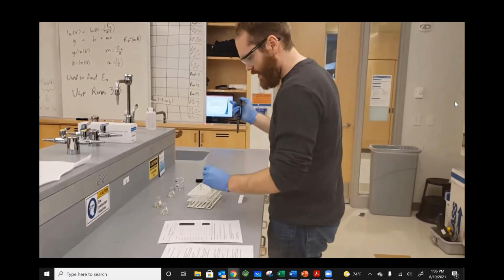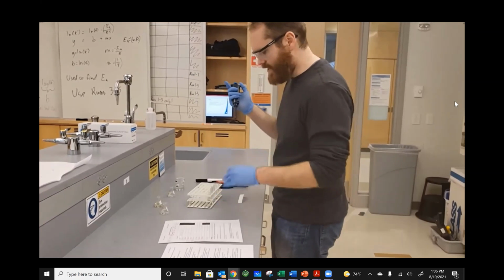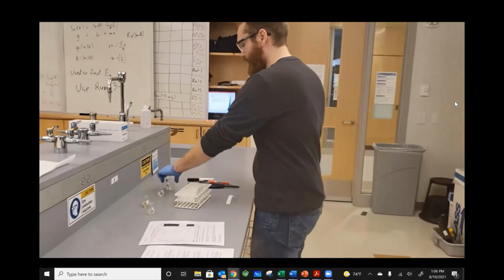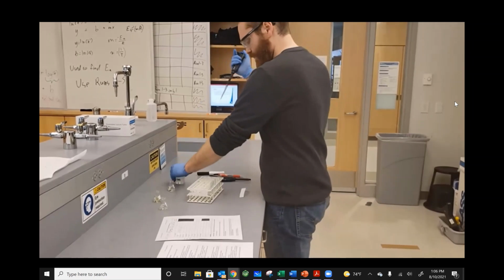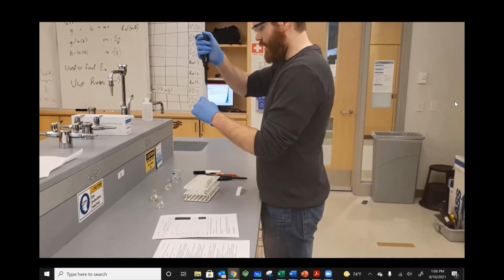And then I want to swap out this tip and move to my water tip. I actually needed 4 tips because I have the additional water added. I checked that I need 400 microliters of water as well in this test tube. Press to the first stage, collect my water, and place this into trial 1.